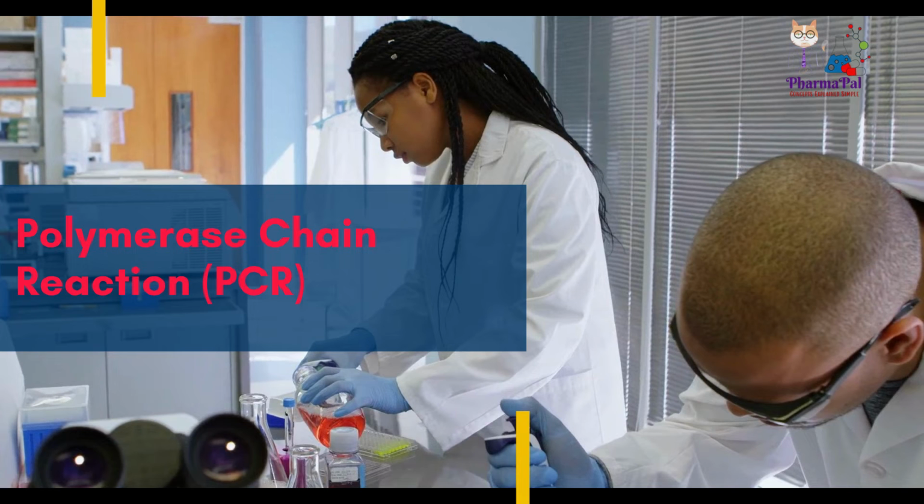To perform PCR, we need a few essential components. Firstly, a pair of suitable primers, one for each strand of the DNA duplex. These primers, usually around 20 bases long, flank the target sequence and require prior knowledge of the DNA sequence.